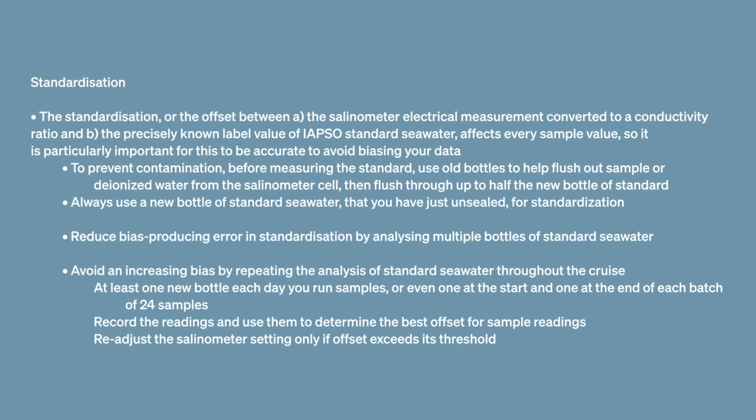But now that the standardization is correct, we hopefully won't touch the standardized knob again. Instead, before running samples, we will check the standardization by measuring a new bottle of standard seawater. We'll record that measurement and subtract the offset from what it should be from all the samples.